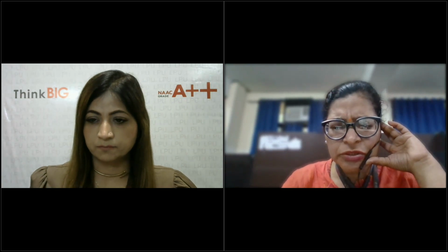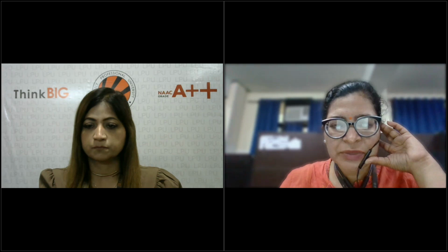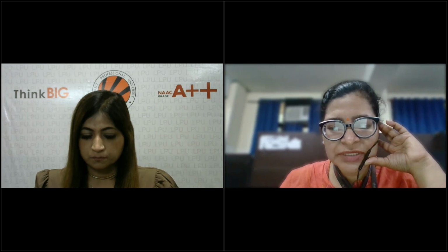If I'm not wrong, I think I showed it in one of my slides also when I started. So you just need to get it from the NIR spectra. Number one, get the spectra. Number two, calculate the aquagram. And number three, plot it and check what is happening to it.